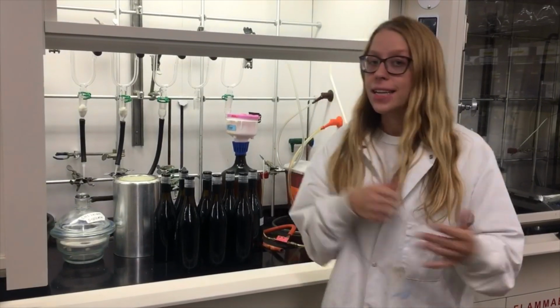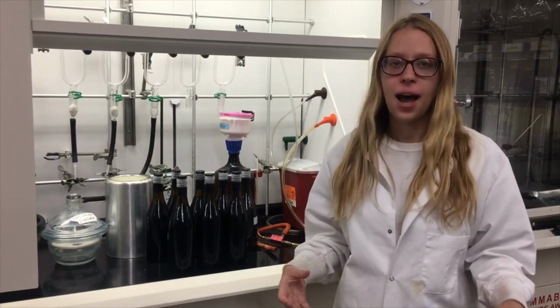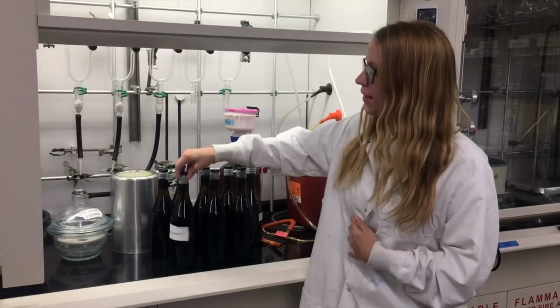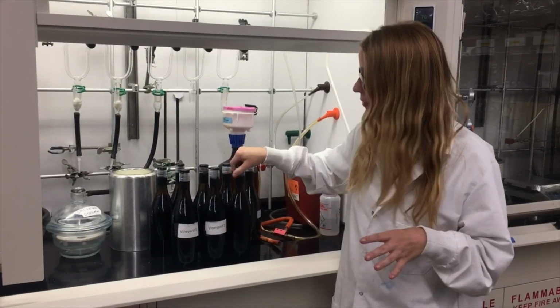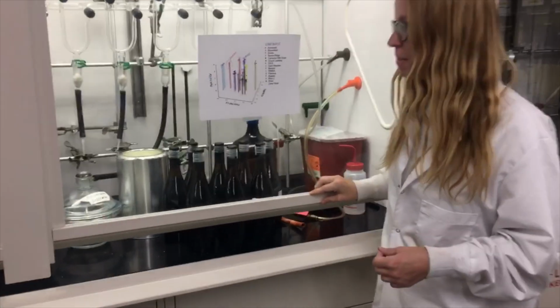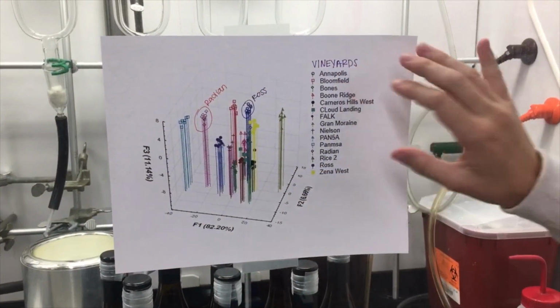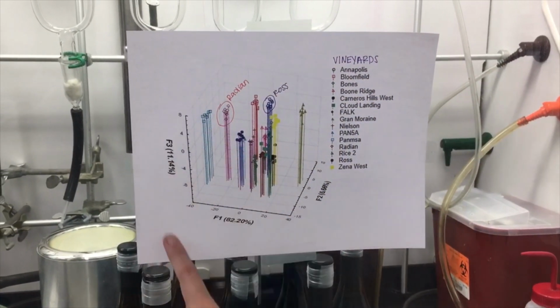So what if now we wanted to chemically differentiate the wines based on the region in which the grapes were grown? For this, we have to use the same wine, which we use Pinot Noir. So how would we be able to say that this is Vineyard 1 and this is Vineyard 1, but be able to differentiate it from Vineyard 2? So for this, we ran another indicator displacement assay, and from the data, we ran another linear discriminant analysis. So from this, we got all of these vineyards, and we were able to differentiate the Radian vineyard from the Ross vineyard based on their axes.